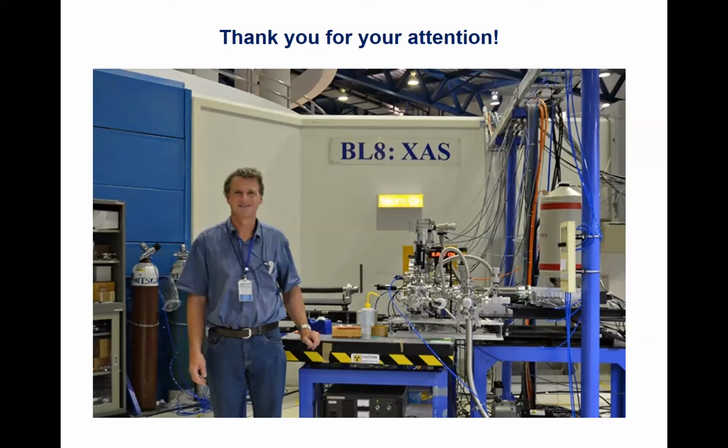In soils, which are a very heterogeneous mixture of unknown compounds, it's very hard, at least to my knowledge, to use these calculation routines for an appropriate correction of self-absorption. So I think I read it in the famous environmental XANES book. I think it was Dean Hesterberg. It's better to avoid self-absorption than trying to calculate the confounding effects of it, in soils at least.